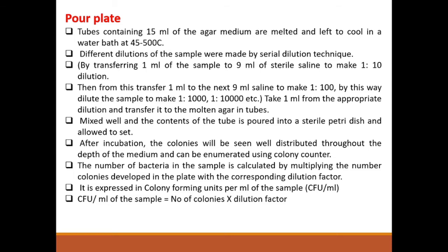Then the next dilution is 1 in 100. How can we make a 1 in 100 dilution? This is a tenfold dilution, not a double dilution. Here we are making tenfold dilutions. After 1:10, the next is 1 in 100. How can we make it?